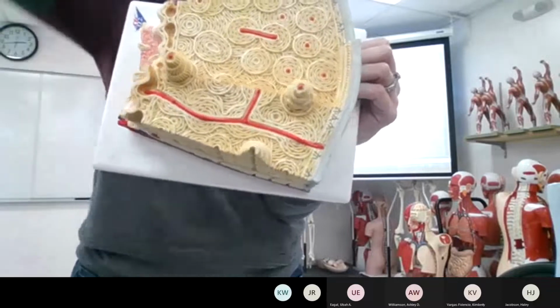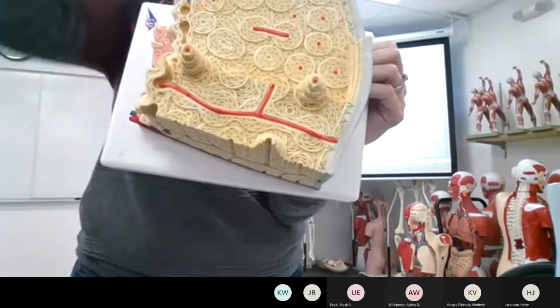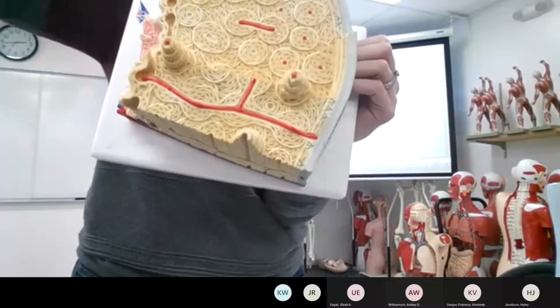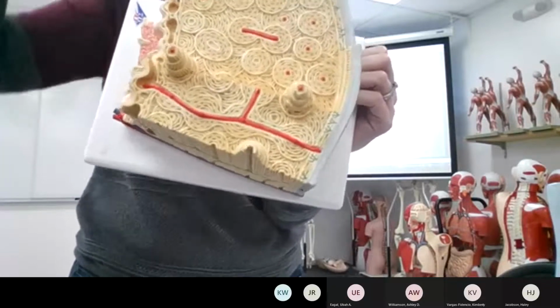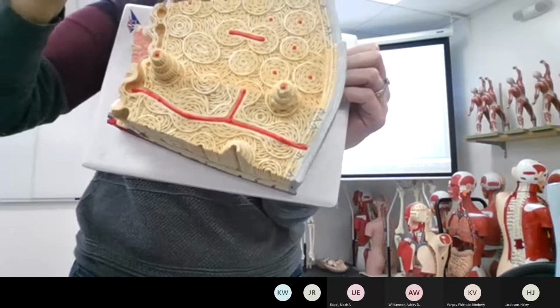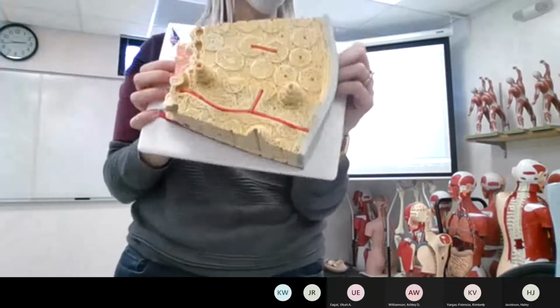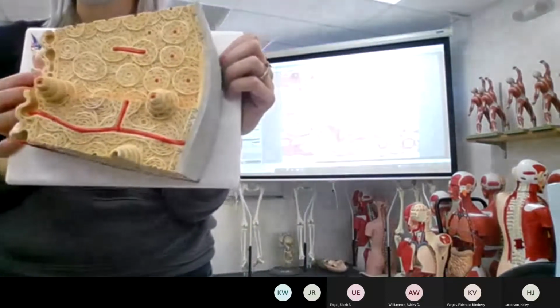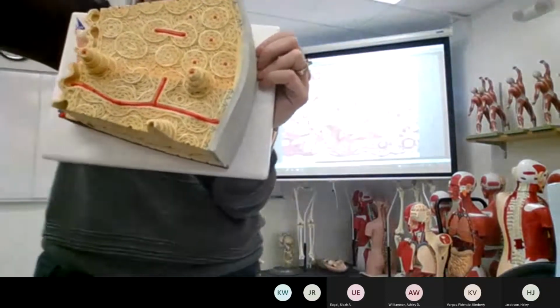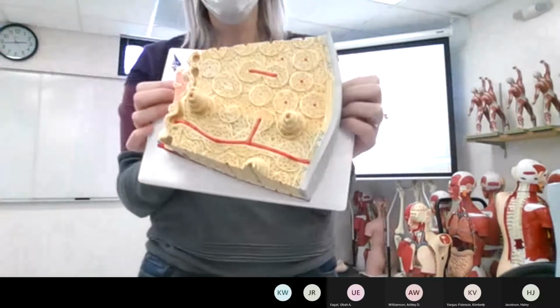The little legs, if you think of them as ants or insects, are digging in the lamellae, and that little tunnel is canaliculi. Those cellular projections are trying to get the cell as close as possible to the blood supply. These cells are in a lacunae because they need to be in water, so they make a little chamber so water can fill.